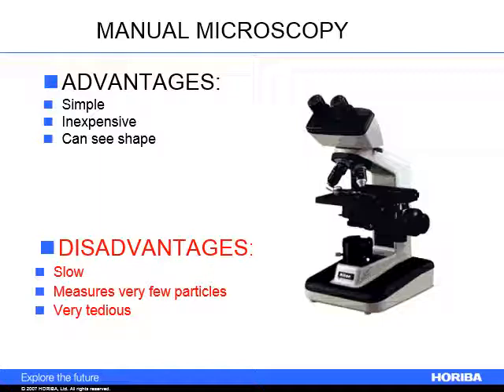However, the issue with the statistics of particle size measurement when you do it microscopically is that it is a slow process that would require you to measure lots of particles to come up with any sort of true distribution math. There's a difference between measuring 30 particles on a single slide and saying that that is the distribution of a rail car worth of material, versus measuring many more particles to come up with a true distribution by other techniques. That's generally the biggest disadvantage you get from microscopy.